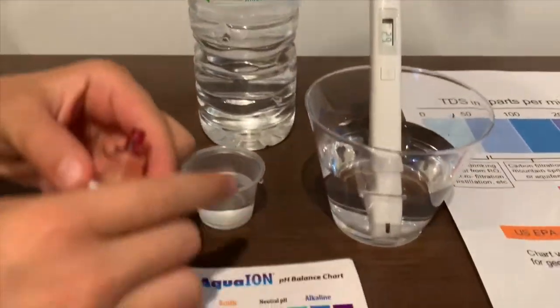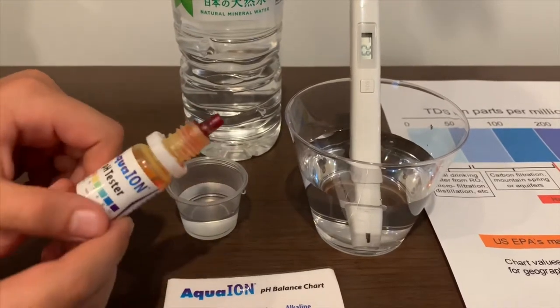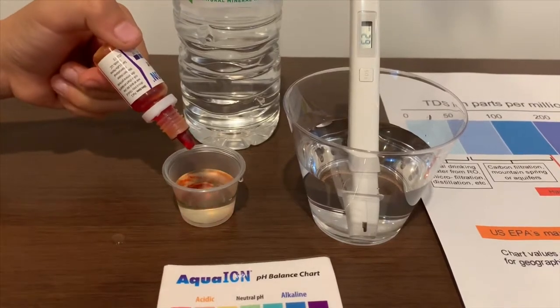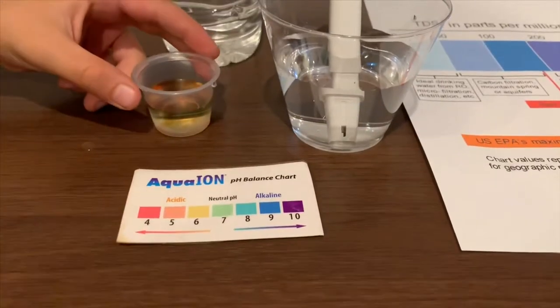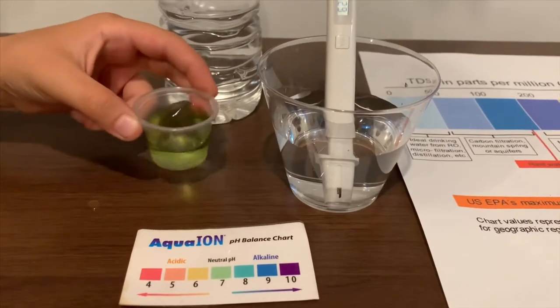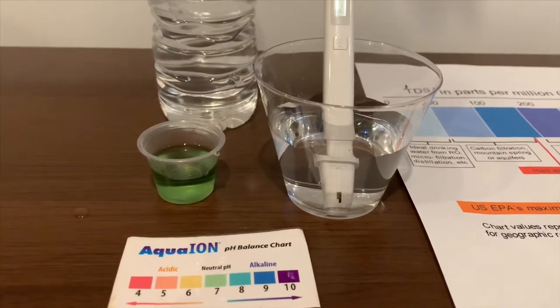Now let's test the pH level. If you want to buy this pH tester, check the link down below. Only do two drops. Let's stir it a little. I give this a 7.5. This is neutral pH.